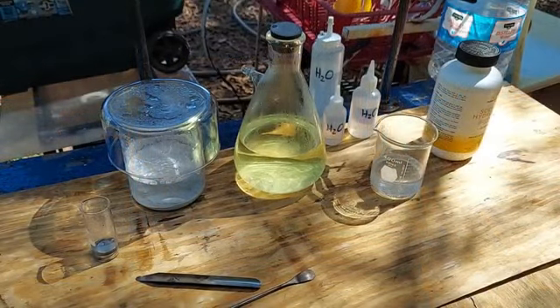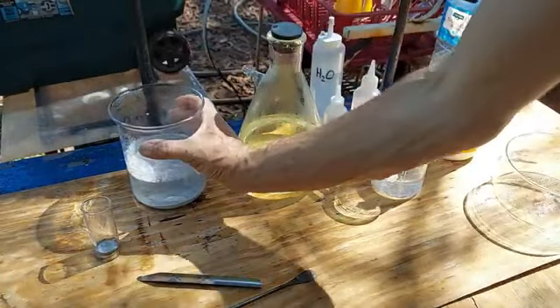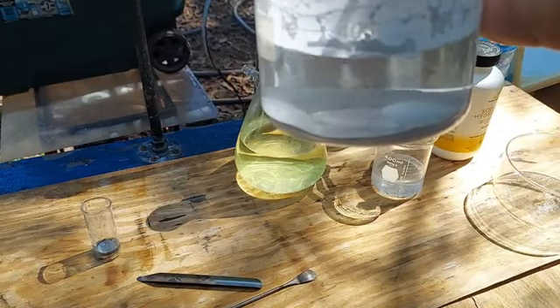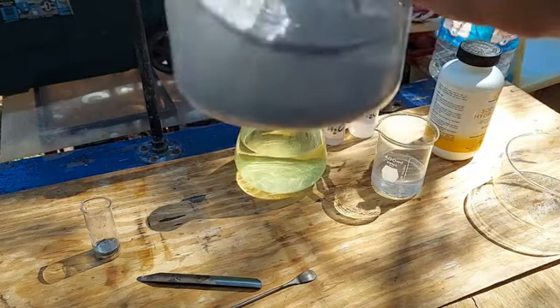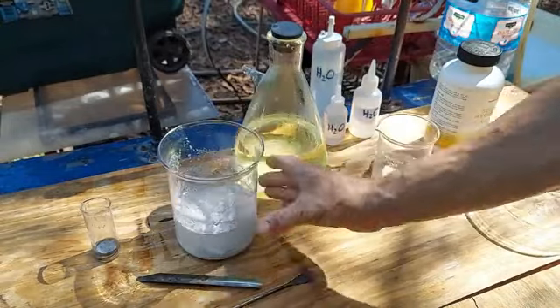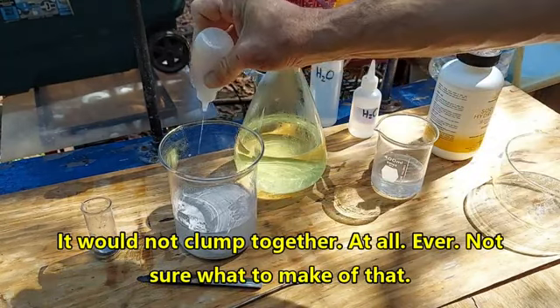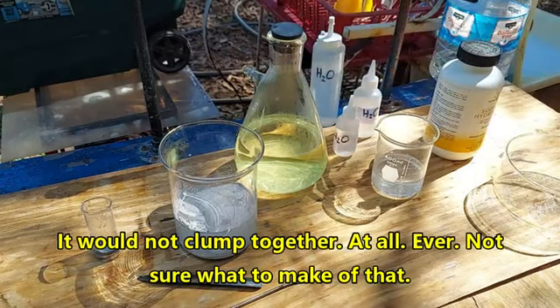Okay, so I precipitated out a lot of this gray material. And then I filtered it off just through a coffee filter and transferred it to this beaker here and heated it up with a cover on the beaker and stirred it. And we've got this dense metallic stuff. I'm honestly not sure exactly what the deal is. It is definitely not a liquid. I am not sure what's going on there.